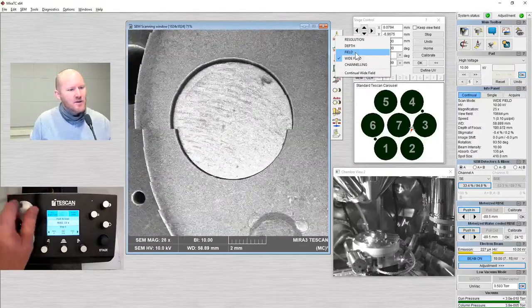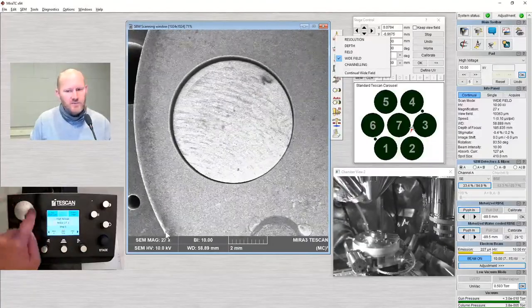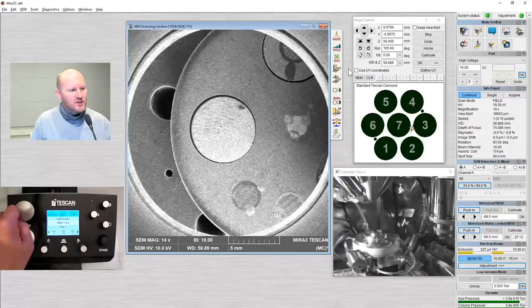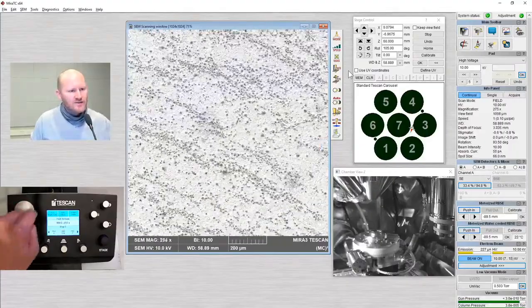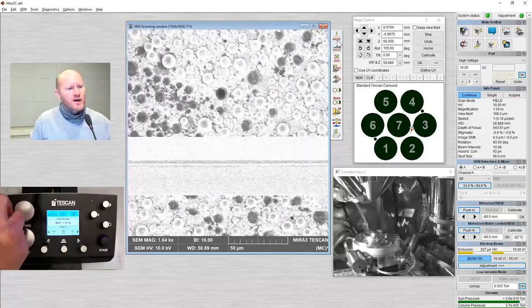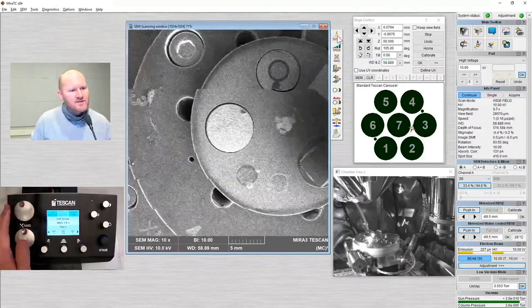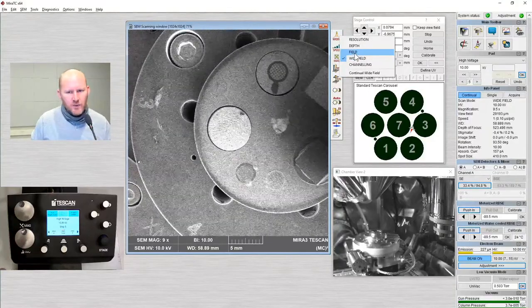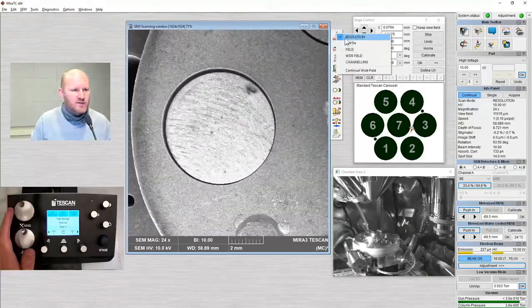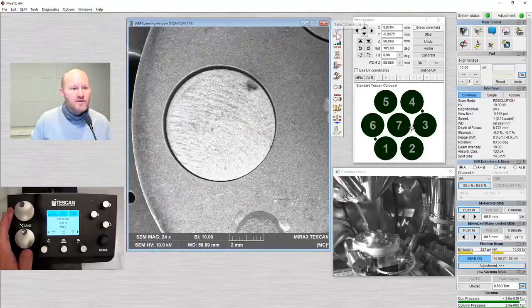Wide field has a maximum magnification of 27 times — I can see it in the data bar. Field mode has a maximum of around 5,000x. Generally, I will only use wide field or field mode for navigating my sample, or if I have a really large sample I want in one field of view. All my imaging will be done in resolution mode. This little window stays connected to the scanning window, and we have a button for the different modes.